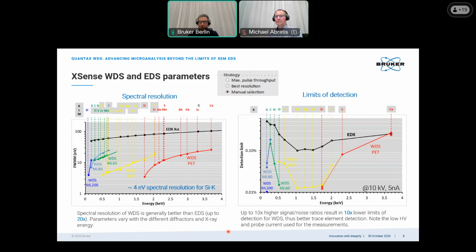There's also one other question that I can try to answer: we are planning to purchase a sample heating stage. Are those stages compatible with WDS or not? Hard to answer. We have no experience with heating stages in combination with WDS, so it's really hard to make a statement on whether the temperature has any influence on the WDS optic.